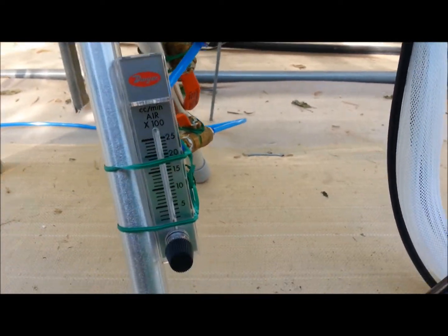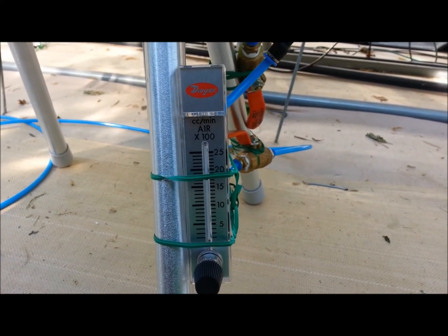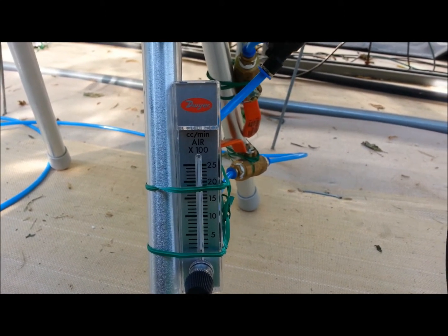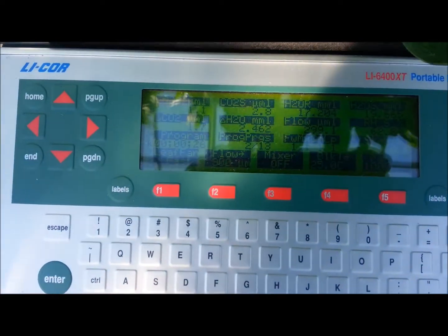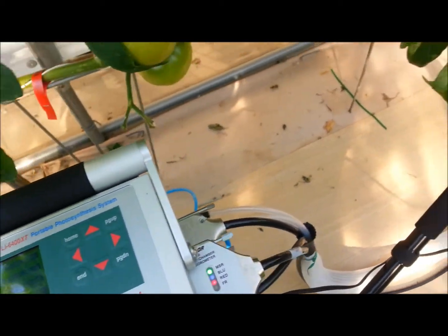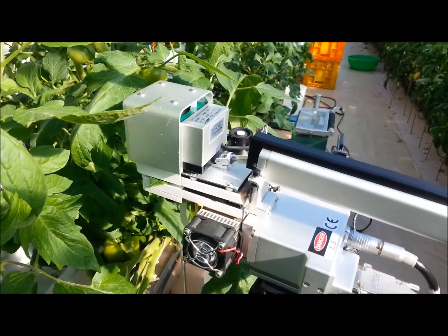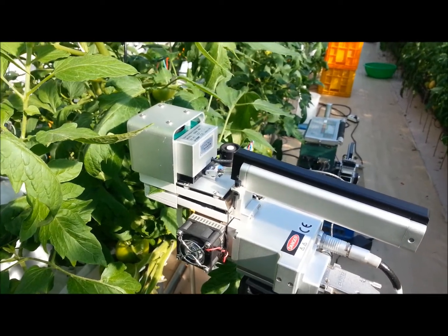Here I can adjust more than 1500 ml per minute. I'm measuring a light response curve and an A-Ci curve, and you can also see the fluorescence measuring chamber.